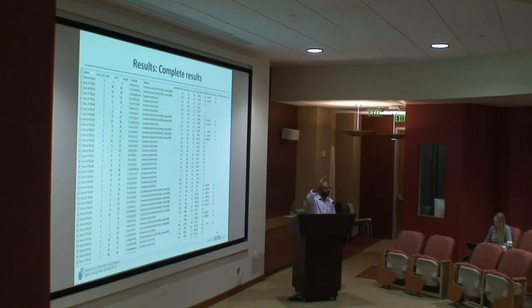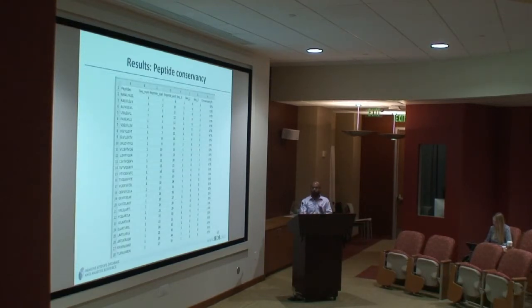This is basically the same as the default MHC Class I binding prediction result. You have the results for all the component peptides, which you can download. And this is the peptide conservancy. We had 3 sequences, and for each peptide it shows which sequences had this peptide present, and the conservancy percentage of this peptide within the sequence set. In case you want to select only the peptides that are conserved in almost all the sequences or 50% of the sequences, you can use this table.